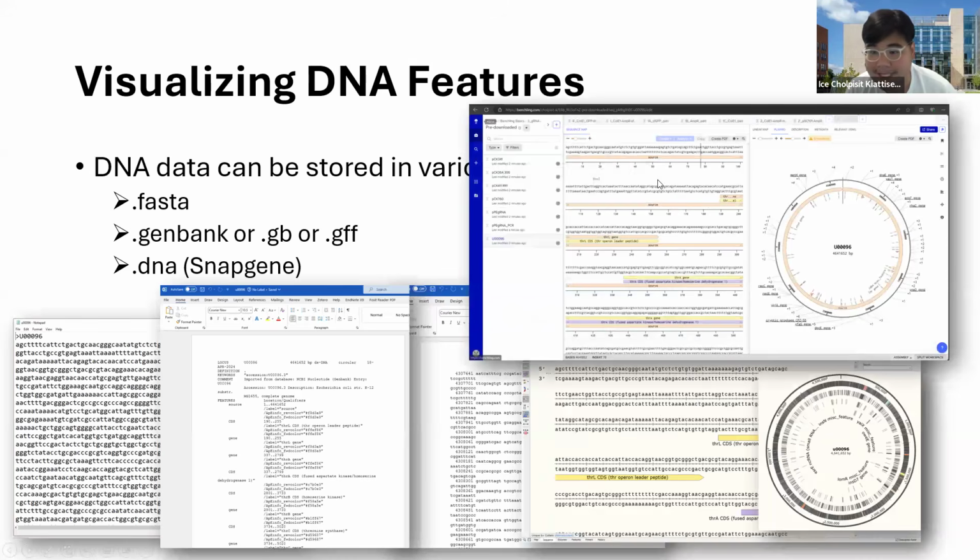The other one is Benchling, which is a cloud platform. I'm sorry, I forgot to mention that Snapgene is actually installed on your computer, so you can work on it anytime. But if you want to use Benchling, you may need internet to edit anything on the cloud. So this is what you see when you take a look at Benchling.